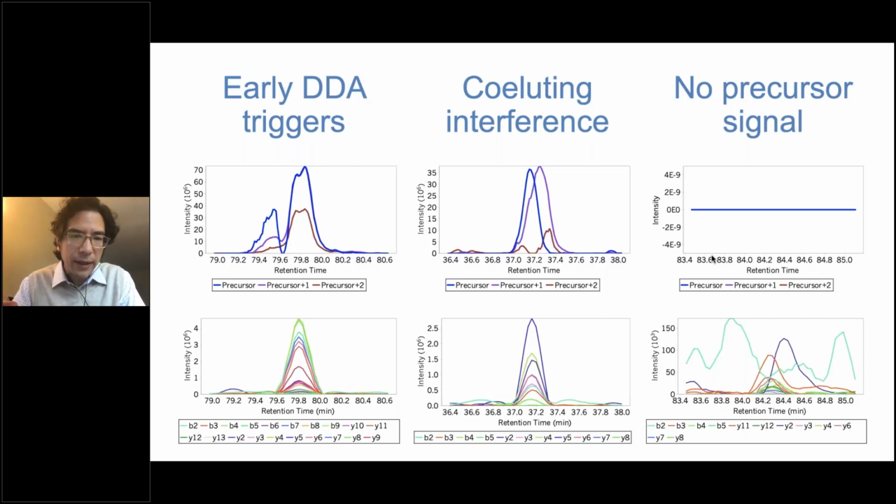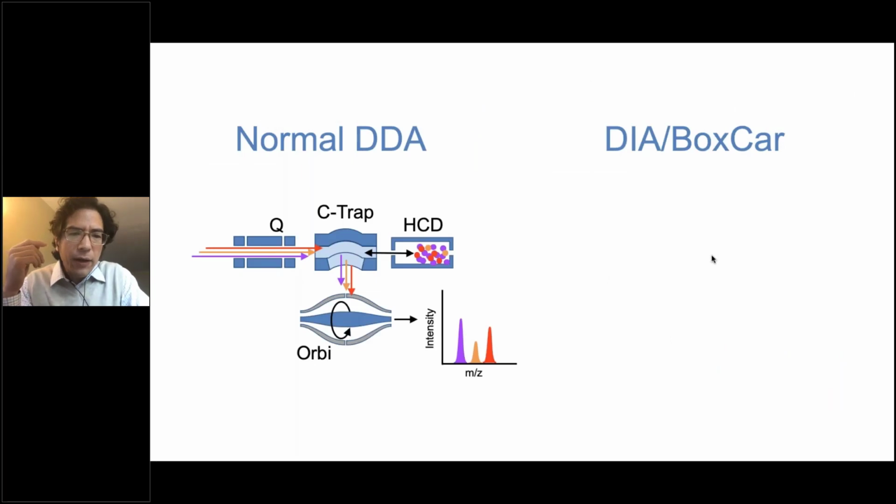I took one data set here, sorted it based on alphabetical sequence, and then found all of these threes within the top 30 peptide sequences. So these are all very common situations for us to see with peptide fragmentation. And I think it's worth thinking about why this is going on.